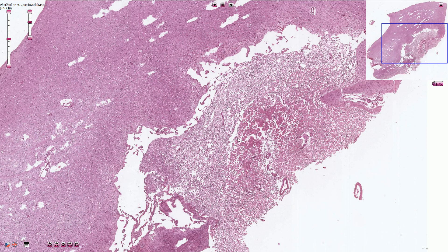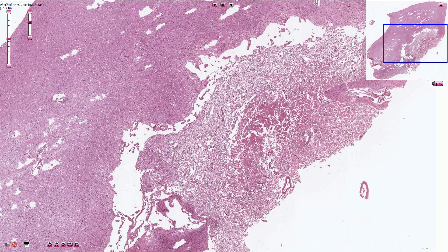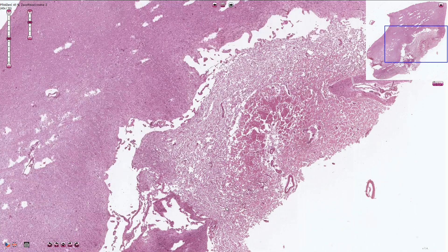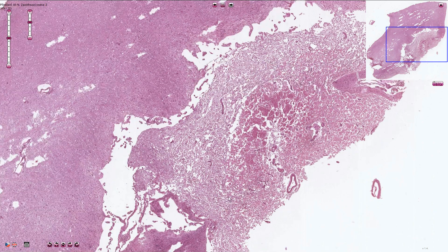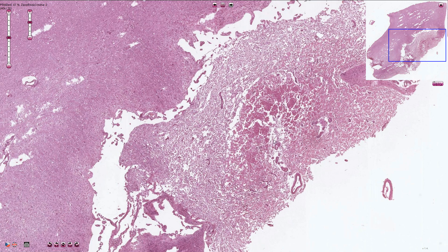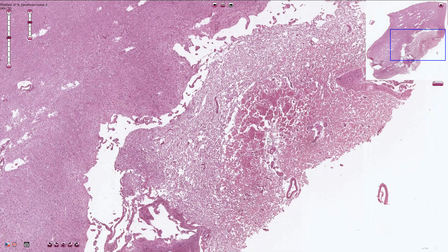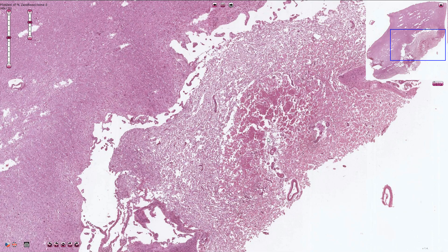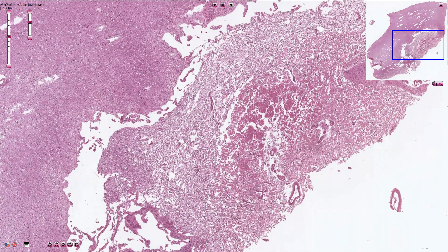This is how encephalomalacia looks like under the microscope — this is the viable part of the brain, and here we have the focus of infarction. Ischemic necrosis can occur via two different mechanisms: either thromboembolism or in situ thrombosis formation. Both of these mechanisms are associated with vascular obstruction.